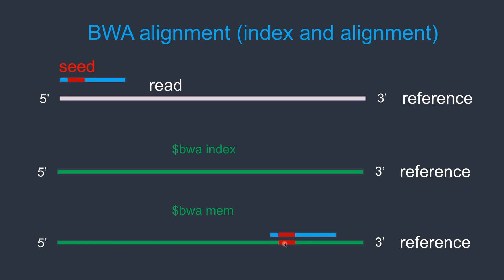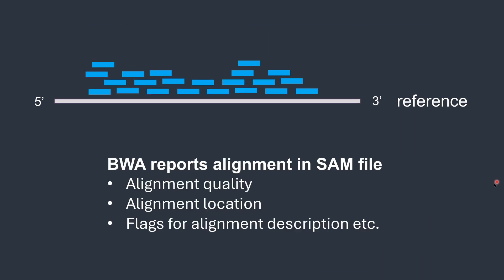In today's tutorial I will show a live demonstration of how we can use the commands to index the reference genome and align using BWA MEM. After aligning all the reads into the reference genome, BWA reports this alignment information in a SAM file. A SAM file is a text file that contains alignment quality information, the location of alignment, and has many flags for alignment description.